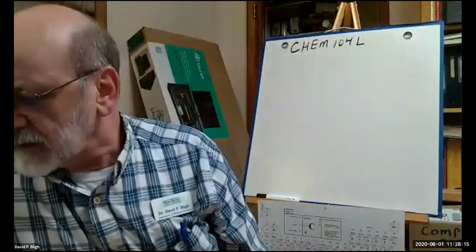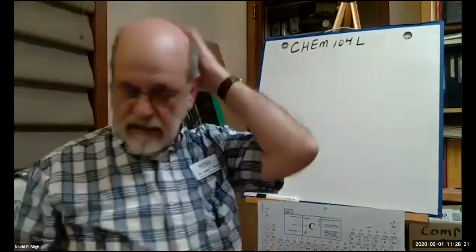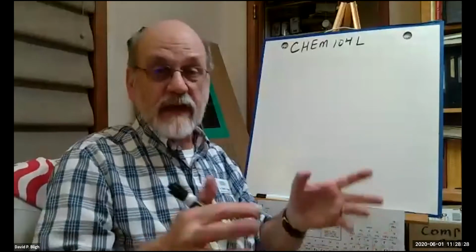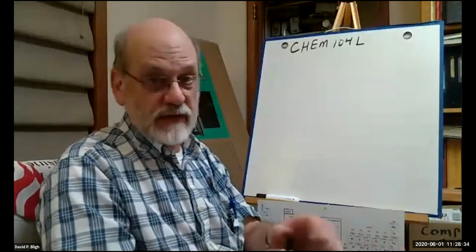All right, materials. Now, what do we do with them? All right, steps of the procedure. It's going to come in 2 experiments that are virtually identical, except one is pure lauric acid and 2 is the solution with benzoic acid included.